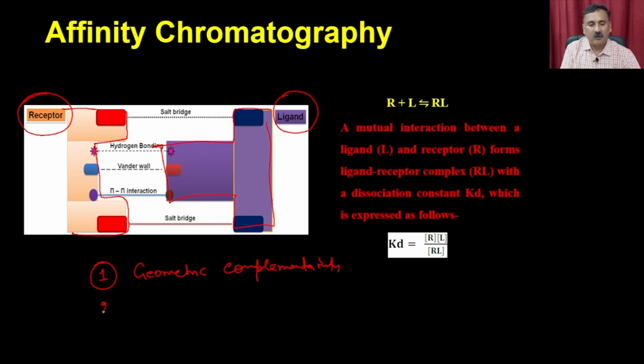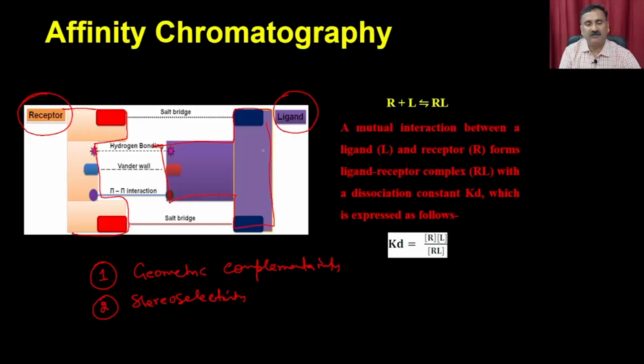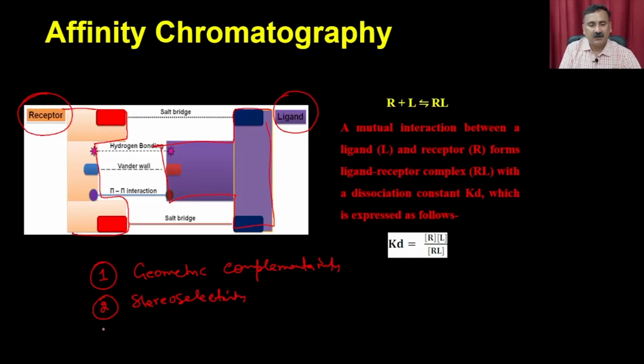Apart from that, it also should have stereoselectivity, which means the ligand should be stereoselective, made up of L amino acids, and the receptor also should recognize the ligands made up of L amino acids. Then the third is the molecular interactions.